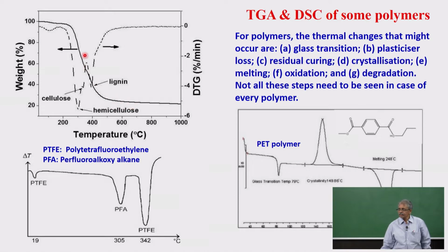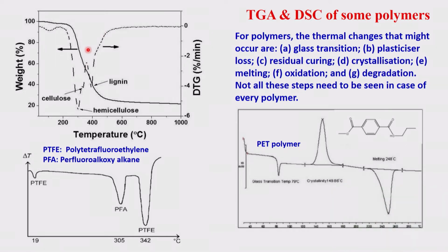thermogravimetric drop in the weight. So this comes at this particular temperature, and this will come at this. This is around 300, this is around 400, close to that. So therefore you are able to differentiate both of them, as you can see here. This is the differential thermogram, which is just a mathematical function, dw by dt or dm by dt. So you can quantify. By looking at the area under this peak and this, by deconvoluting, you can tell the ratio present in that.